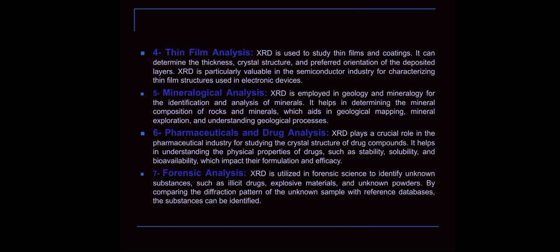Sixth one is pharmaceutical and drug analysis. XRD plays a critical role in the pharmaceutical industry for studying the crystal structures of drug compounds.